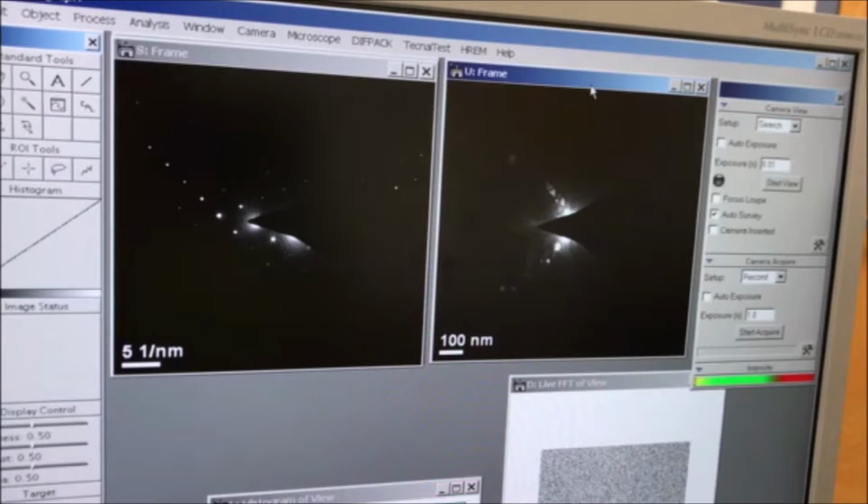So now there's only one unique rotation that I can use in order to get the parallelism between the pattern and the image. Okay, so now I have the ability to correctly deduce which way I'm supposed to rotate my pattern. So I'm not able to pick between two possibilities. It's only now one possibility.